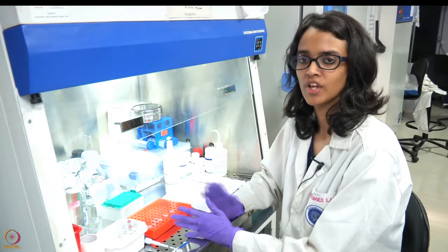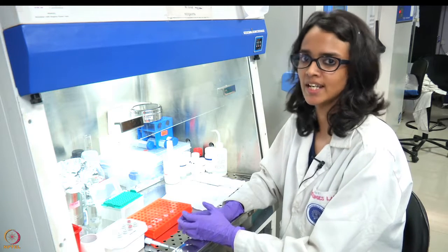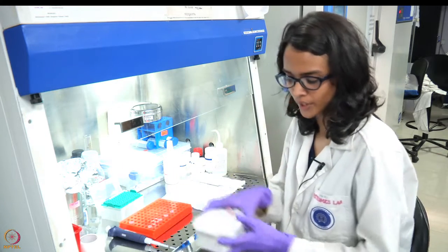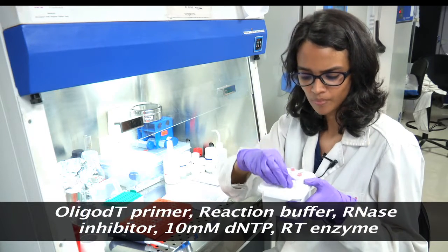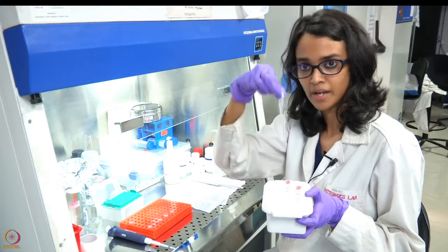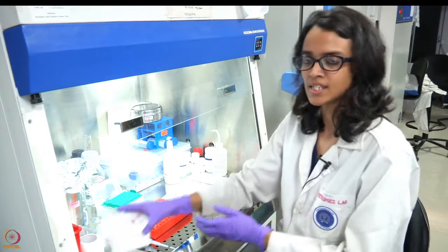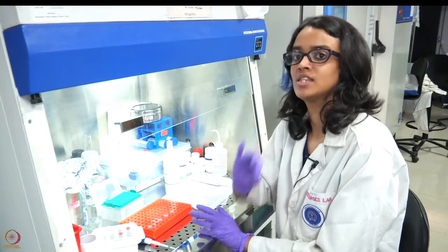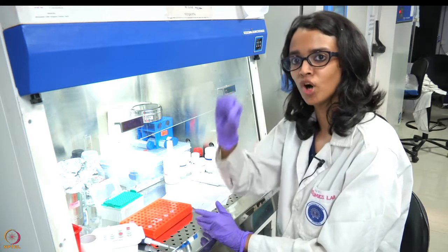After the EDTA step, we are now done with genomic DNA removal and will proceed with the cDNA synthesis step. The cDNA synthesis step involves the addition of the following components: the oligo dT primer, reaction buffer, the Ribolock RNase inhibitor, 10 millimolar dNTPs, and the reverse transcriptase enzyme. Since we are using an mRNA as a template, we are going to use an oligo dT primer, which is a stretch of thymine nucleotides that will bind to the poly-A tail of the mRNA.